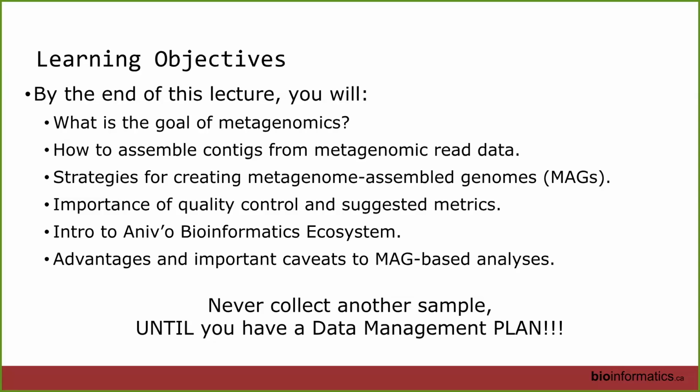What I really want you to come out of this with is that you'll never take another sample until you have a data management plan. So you should never collect another biological sample after this workshop until you have a plan for your data analysis. It is absolutely a crucial part of planning your research. If you make data that's not compatible with the analyses you want, you've wasted all of your money, all of your time, and that's bad. So let's not do that.